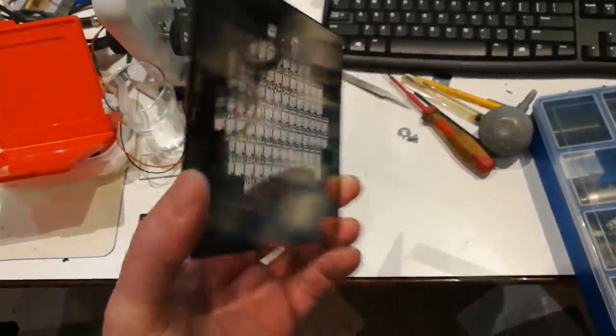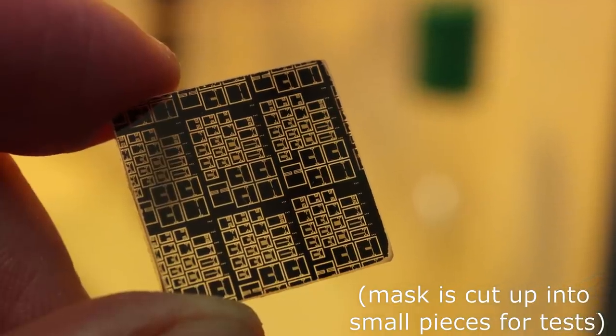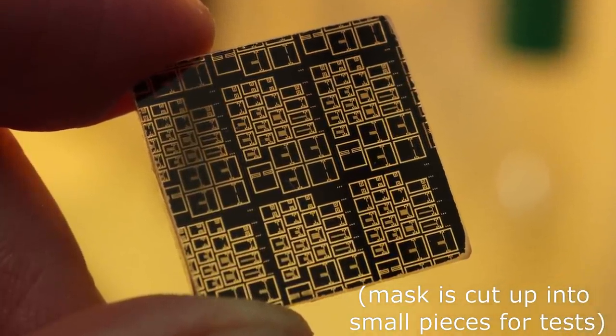But to show you that this method works really well, I tried using an old photomask that already had a very fine chromium pattern on it. So this is after etching when looking under a microscope. By turning up the backlight level, you can actually observe the profile etched in the glass through the chromium because it is partly transmissive. What you see is that the pattern etched in the glass is wider than the openings in the chromium layer. And this widening on both sides of the track is equivalent to the etching depth, due to the isotropic nature of the process.